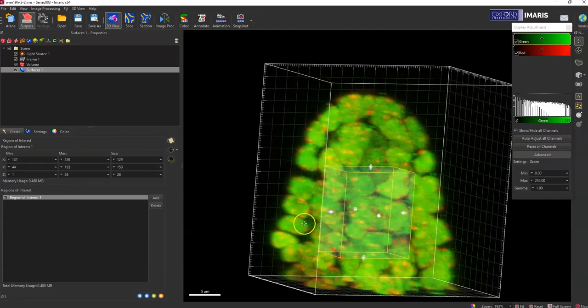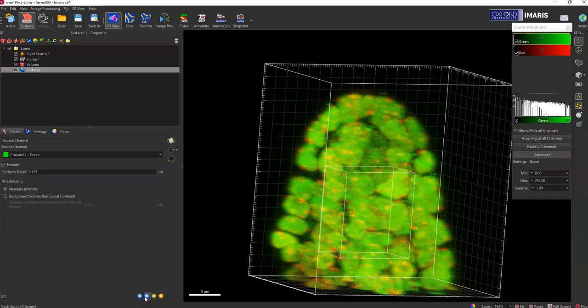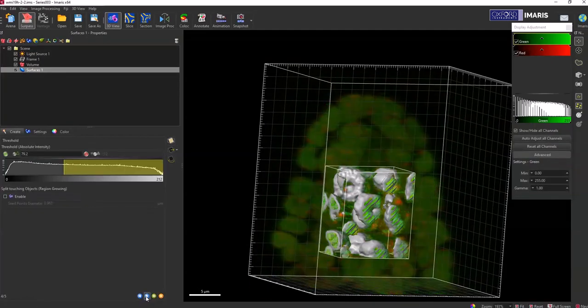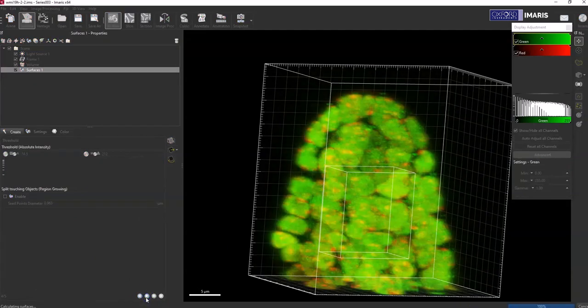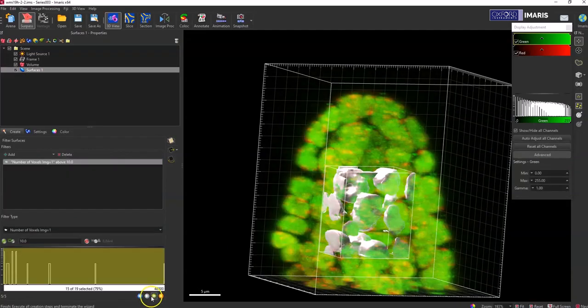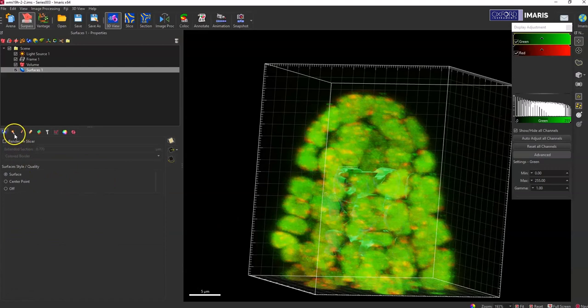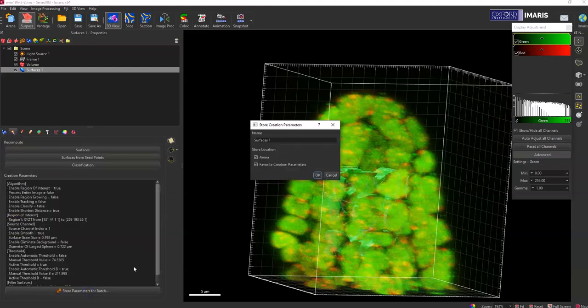And once you're satisfied with what that region is going to be, just keep moving forward. I'm just running through this, it doesn't really matter what the surface looks like in the end for this process. But once you're satisfied with your object creation parameters, you'll then want to store the parameters for batch.